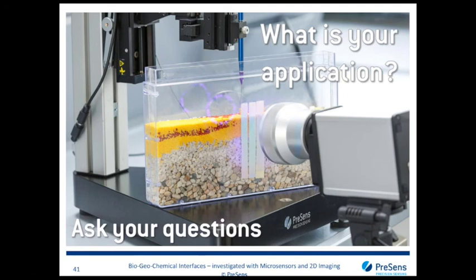And our last question refers to the response time of the microsensor. I hope we answered some of that in the webinar already. Maybe to point out, the microsensors are really fast, especially the oxygen microsensors. In the gas phase, they are even faster, so there we can reach speeds on the millisecond level, while in the water phase or aqueous media, we are usually on the second level up to 10 seconds.